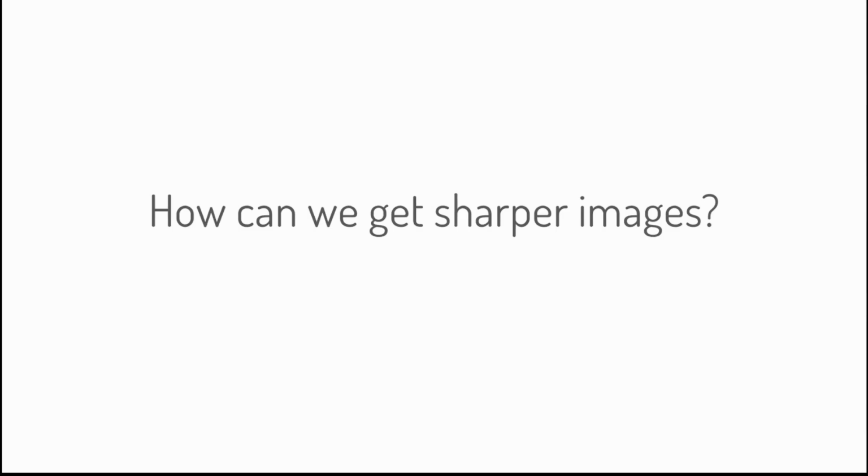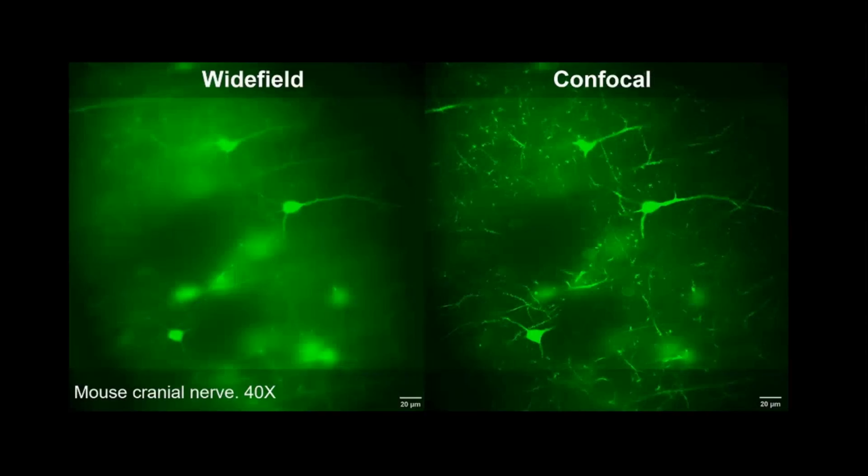The typical answer normally is that we go to a confocal microscope. And in a confocal microscope, we can convert a blurry image to a sharp image. So this is the part where I will explain more or less the differences between wide field and confocal, because the two-photon is very similar to the confocal. So you have to understand this difference first.